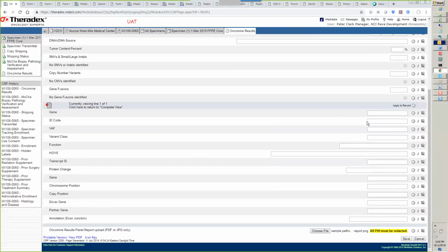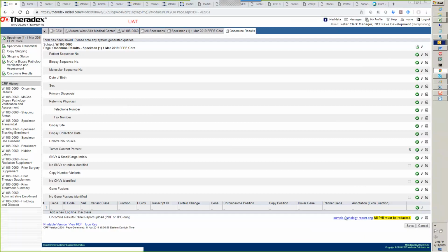Okay. So Peter, real quick, can you show that the file has been uploaded, for Patty's sake, so we've confirmed that it's been uploaded at this particular time? Right. Here we can see it hasn't been uploaded because it's not a live link. When I click on the Save button, it uploads the file, and we have this blue live link that anybody who has access to this page could download onto their computer.